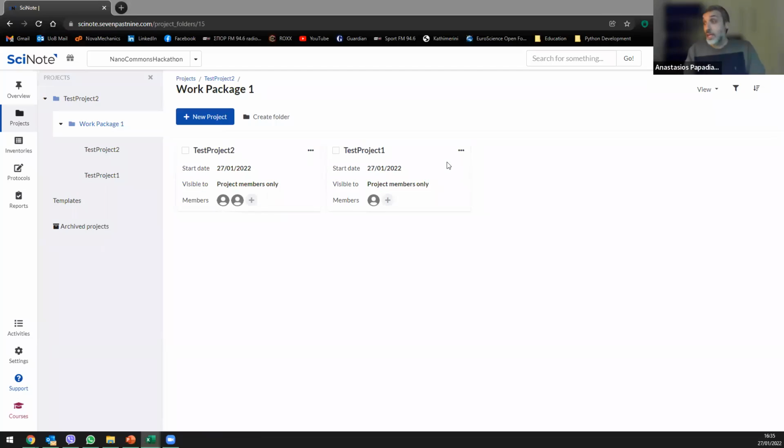And as I said, one of the cool features of an ELN is that it can provide a basis for creating a report or a publication, or an abstract that you can rely on to start writing something. By no means, although it depends on how you set it up, should this be considered a full report.